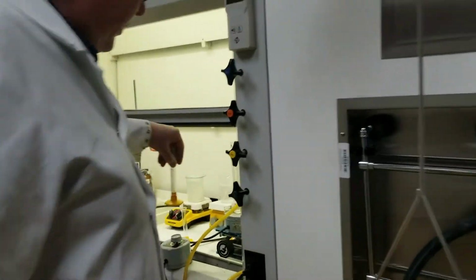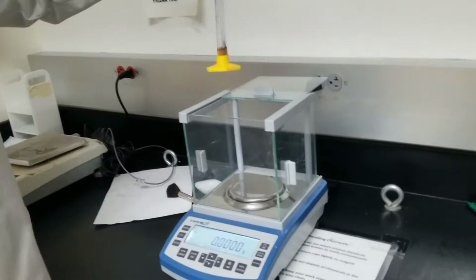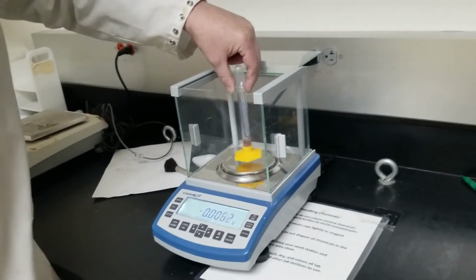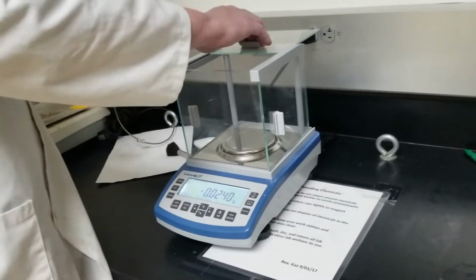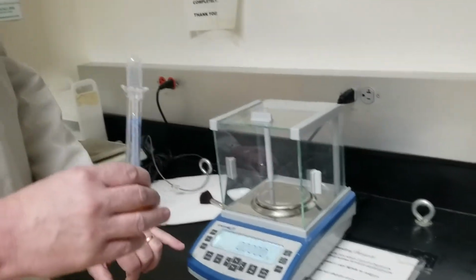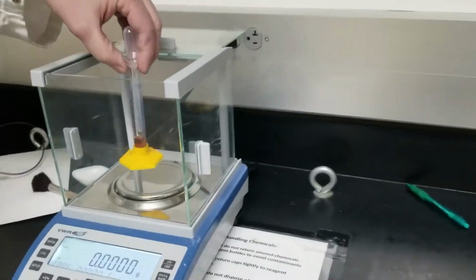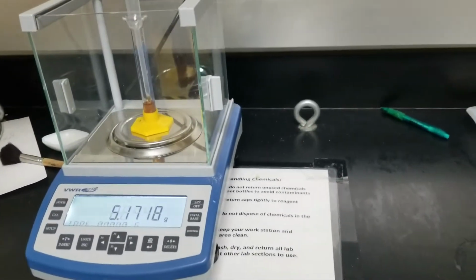Now we'll do the same thing with the aniline and the dropper. We're supposed to add the aniline dropwise, and we're going to lose some. So how would you describe the odor of aniline? Fishy. Yeah. Yeah, rotten fish. I describe it as fishy nastiness. Yeah. You guys are missing out. Bad fish.